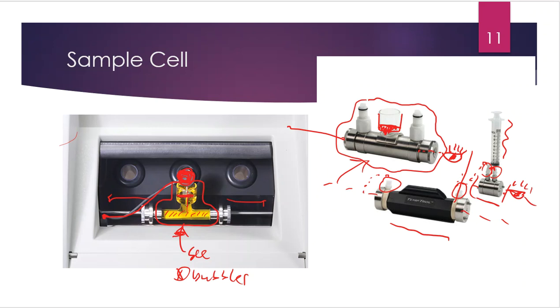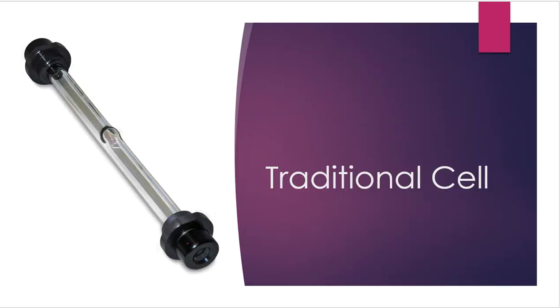As far as the manual option goes, though, these were the old-timey polarimeter tubes, and these were always difficult to get loaded up the proper way. What would happen with these old-timey, more manual ones is that these pieces would be screwed off, and then you would fill the tube up to the top with your sample, and you would want to overfill it in a way.